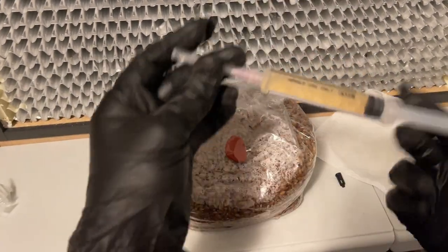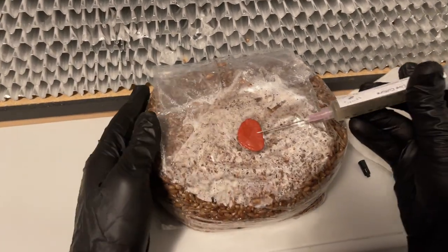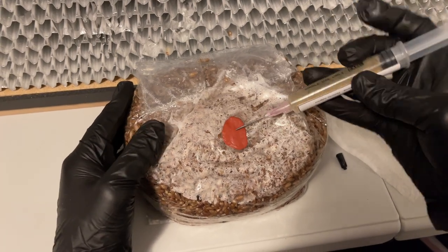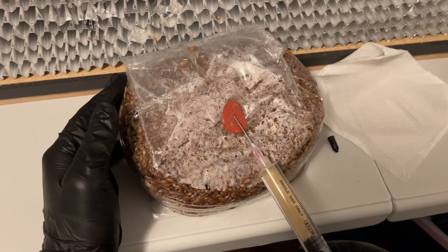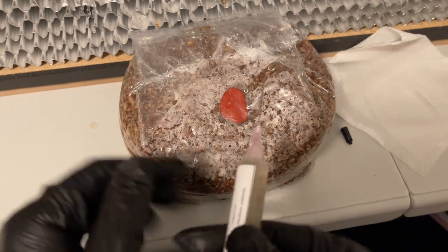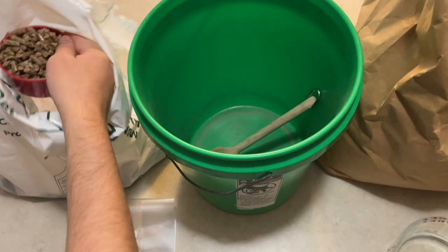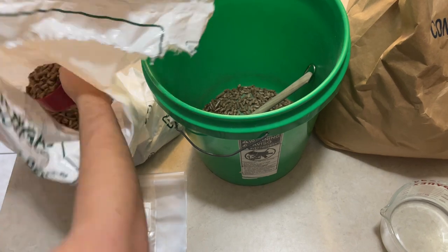Make sure your work area is completely clean and wiped down with isopropyl alcohol. The grain spawn is now incubated at 75 to 80 degrees for 2 weeks. Once your grain spawn is nearing full colonization, the next step will be to make your sterilized substrate.